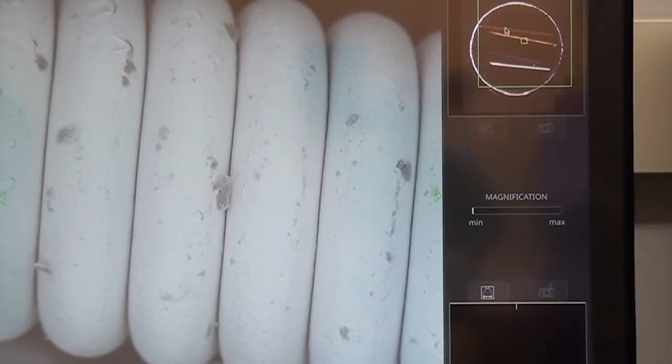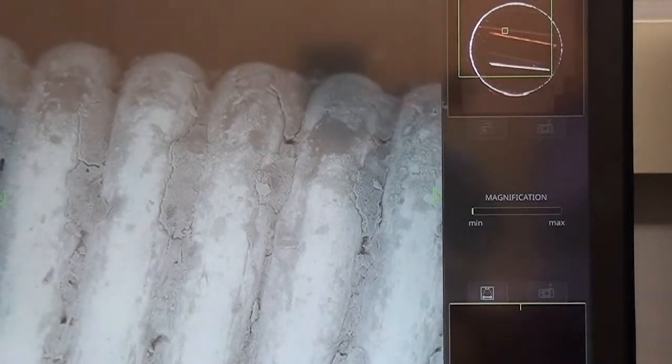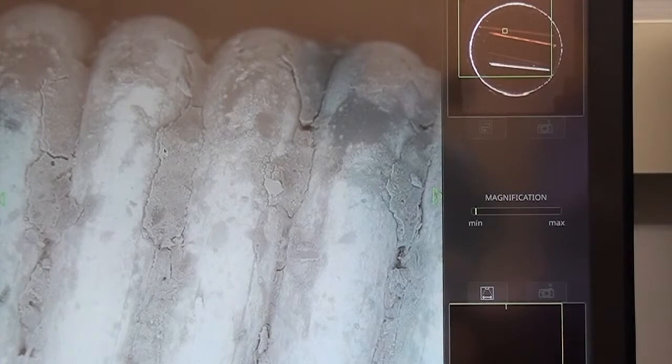Now we can go and look at the other piece of metal. And wow, look at this. This one has so much more of the darker areas and this almost powdery substance must be the oxide.